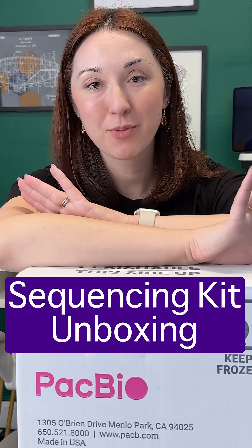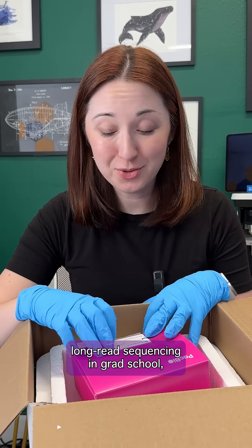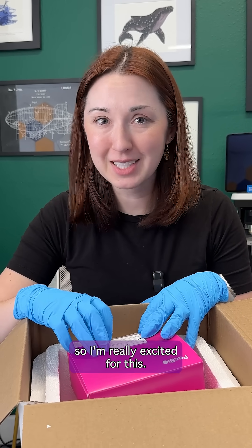Let's unbox a sequencing and library prep kit from PacBio. I used to do a lot of long read sequencing in grad school and I don't get to do it much anymore, so I'm really excited for this.